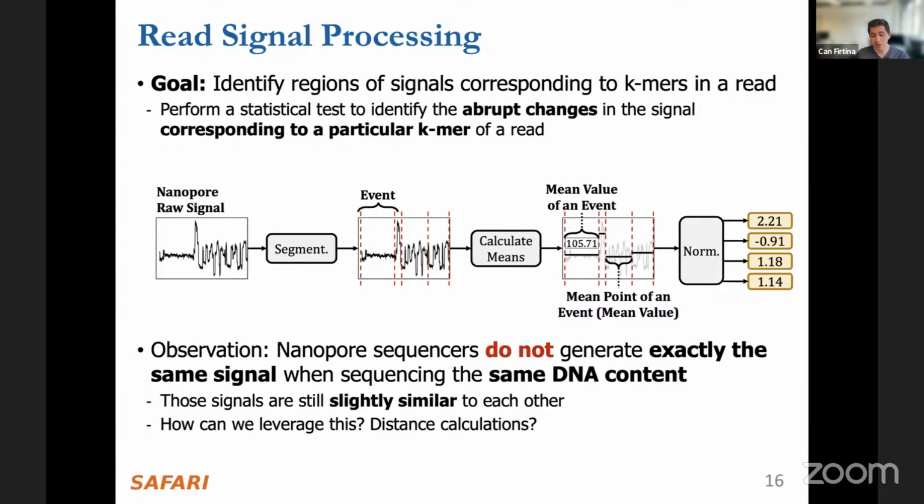The signal reading may differ for several reasons. For example, due to temperature, or due to certain biological or epigenetic reasons in the DNA molecule, such as a molecule being methylated. That's why we might read the signal slightly differently. The DNA can also be read slightly faster or slower, depending on certain environmental situations at a particular time.